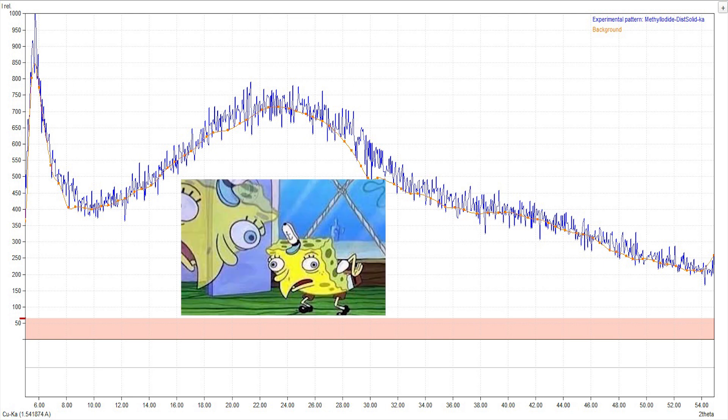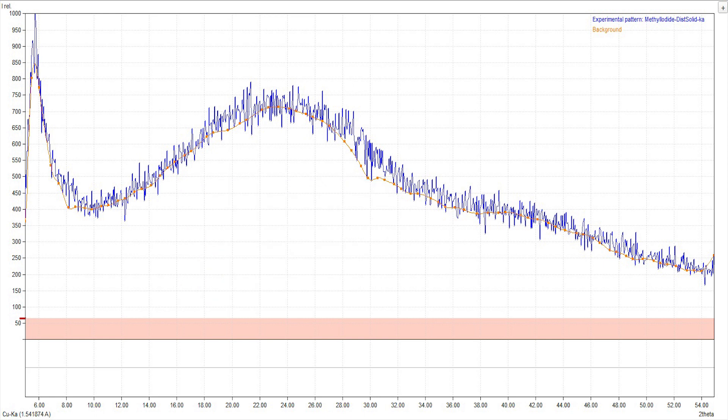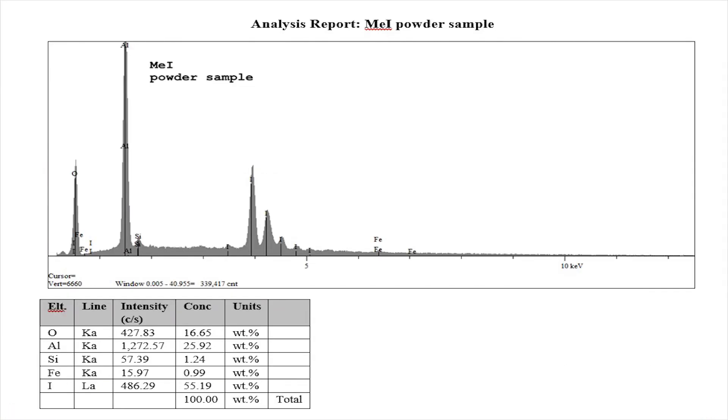I took the time to do an elemental analysis and that told me a lot. I can see I've got a lot of aluminum, a lot of iodine, and a lot of oxygen. However, for now I'm going to sit on that information and work on the distillate.